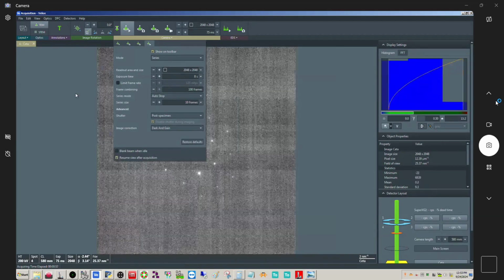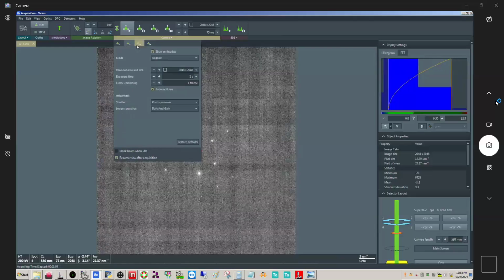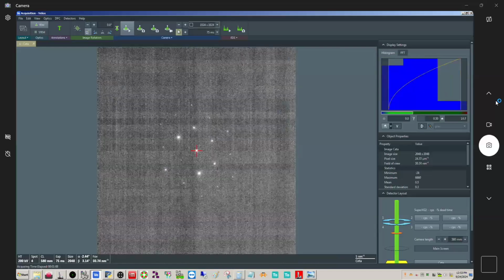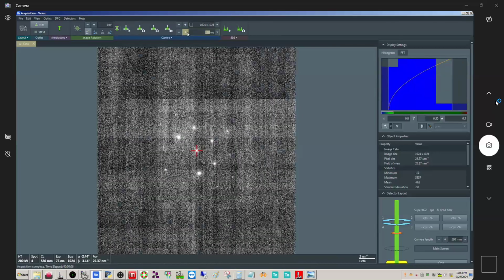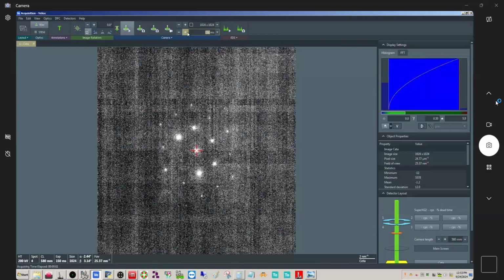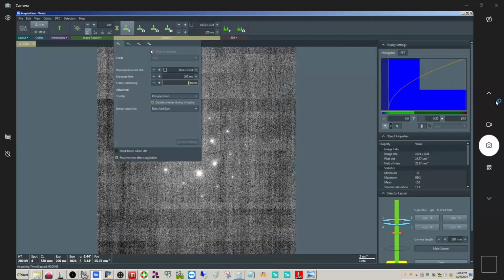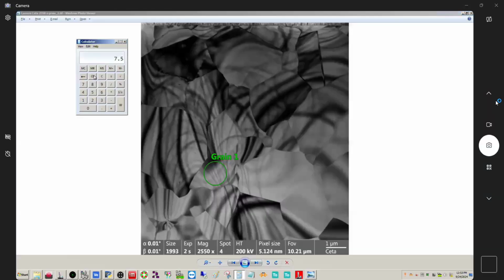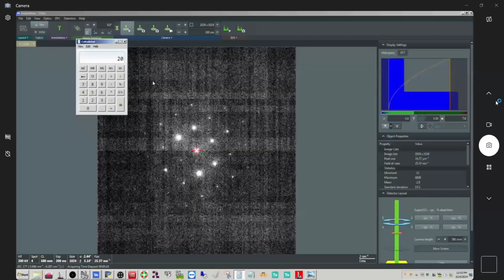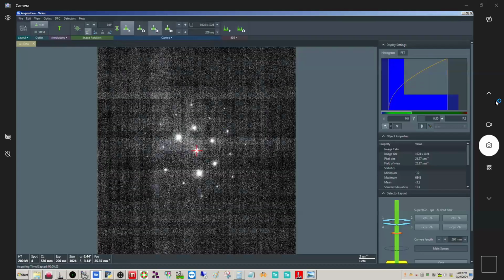The other option, of course, is that since we weren't getting the clipping at 1K, we could drop this down to 1K resolution. So if we drop this to 1K, and we also drop this to 1K, this is still safely under at 1K resolution. At 200, yeah, this is still okay, so let's try that instead. We'll put this at 100, that's 200 milliseconds. So 100 times 0.2, that's 20 seconds. All right, let's see what we get here.